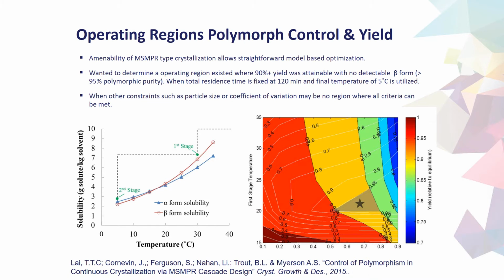So this was found to be the case, and a follow-up study here shows the phase diagram for para-aminobenzoic acid. So this enantiotropic system has a high temperature stable form, which is an alpha form, and it has a low temperature stable form, which is called the beta form.